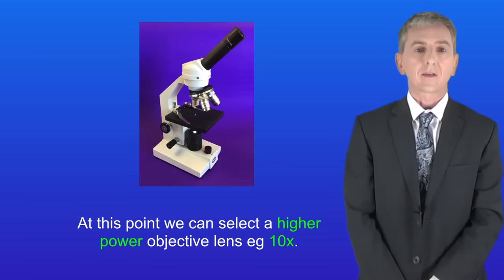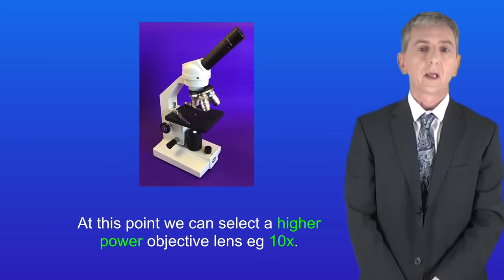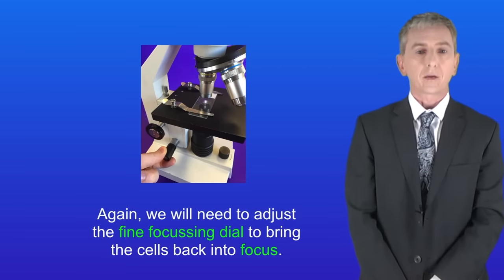At this point we can select a higher power objective lens, for example 10 times. Again we'll need to adjust the fine focusing dial to bring the cells back into focus.